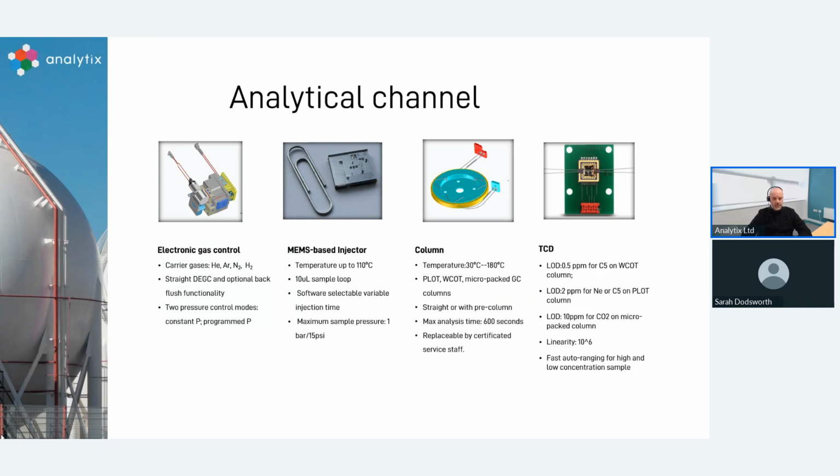And instead of using volume, we use injection time, so that we have very reproducible results. Because we're working with nanoliters really of gas that's going through the analytical portion of this channel, we've got very good control and very good reproducibility by using these micro injectors based on time.